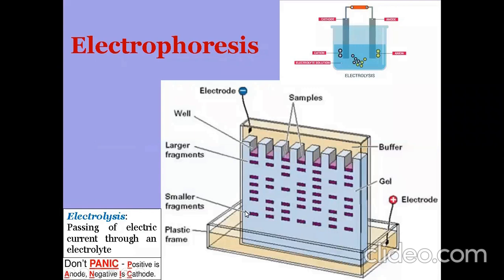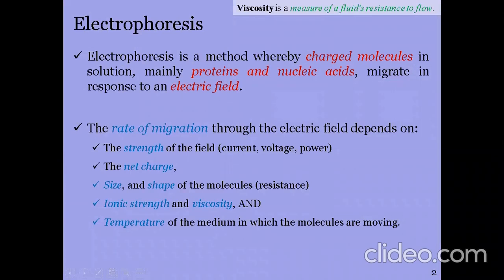Viscosity is the measure of fluid resistance to flow. The more viscosity, the more resistance the fluid will face in flowing through the gel. Electrophoresis is a simple and straightforward, highly sensitive, and rapid technique.